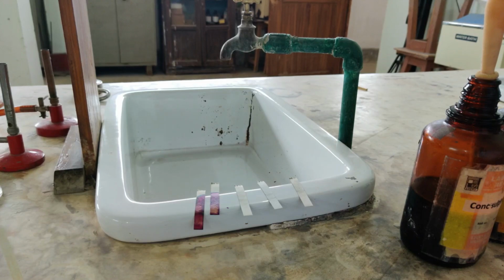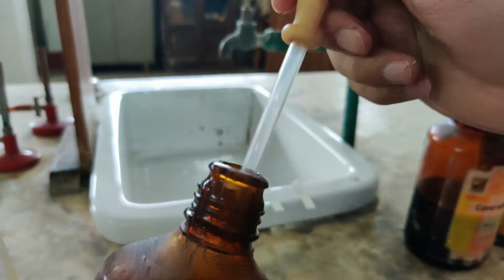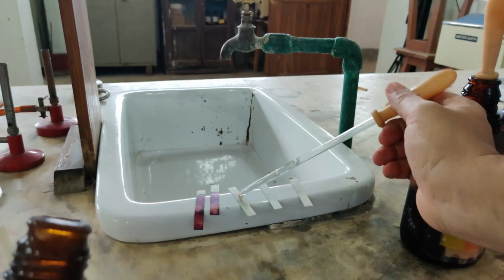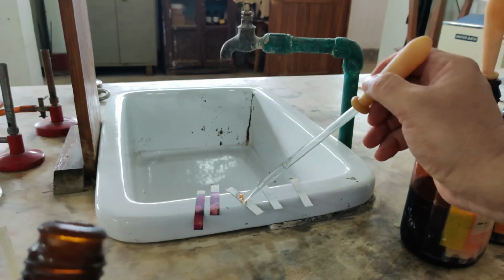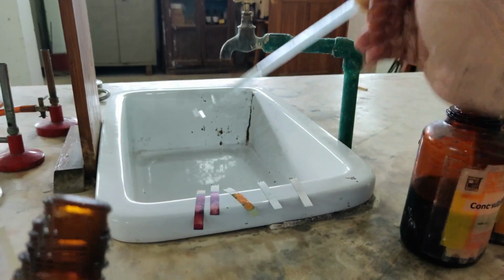Then I am going to go now with the third one, that is here dilute sulfuric acid. Let's see what happens with dilute sulfuric acid. So if I am using dilute sulfuric acid, here it is in this strip, in the middle of the strip only I am putting dilute sulfuric acid, and let's see what color changes you notice here. Here it is. This is dilute sulfuric acid.